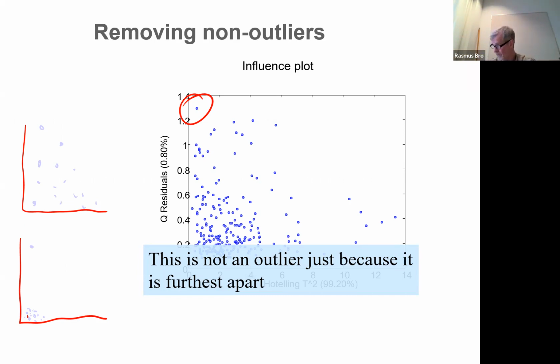And also related to that, remember that an outlier is not a wrong sample. An outlier is just a sample that's different from the other ones. And sometimes the reason for that is your fault. Maybe you sampled in a stupid way. Maybe you wanted samples that were red, green, and blue, but you only took blue samples and 1 red one. So naturally, the red sample comes out as an outlier. But the conclusion that you would reach is that, hey, I need to sample better.